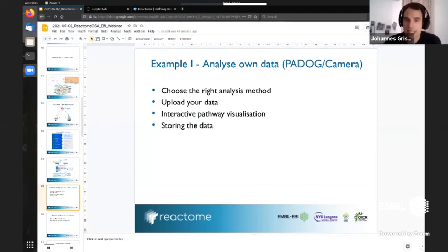That said, what we do is we then check to which pathways a gene maps, because of course, we then map your identifiers. Now, if you, for example, use gene symbols, they can be quite ambiguous. We have the same gene symbol for a few genes sometimes, or isoforms as you put here. In that case, we check how many pathways it maps to, and then we have this 1 to n phenomenon. So one entry might map to 3 entries in our backend.